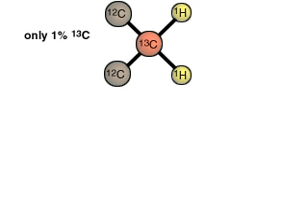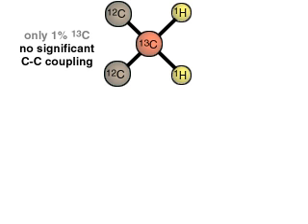The chances for two carbon-13 atoms to be adjacent in a molecule are slim. Therefore, no significant carbon-carbon coupling is observed.